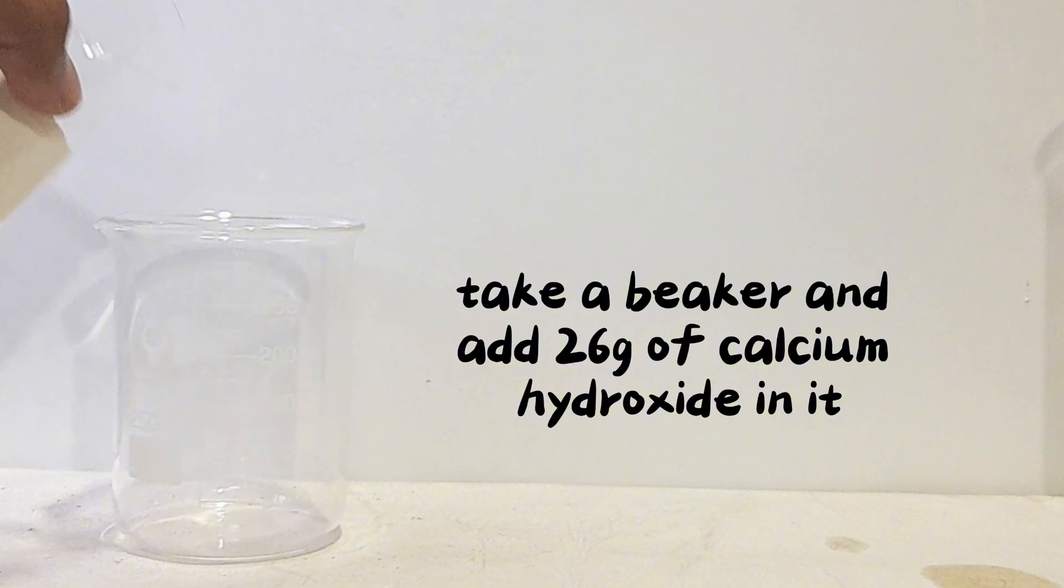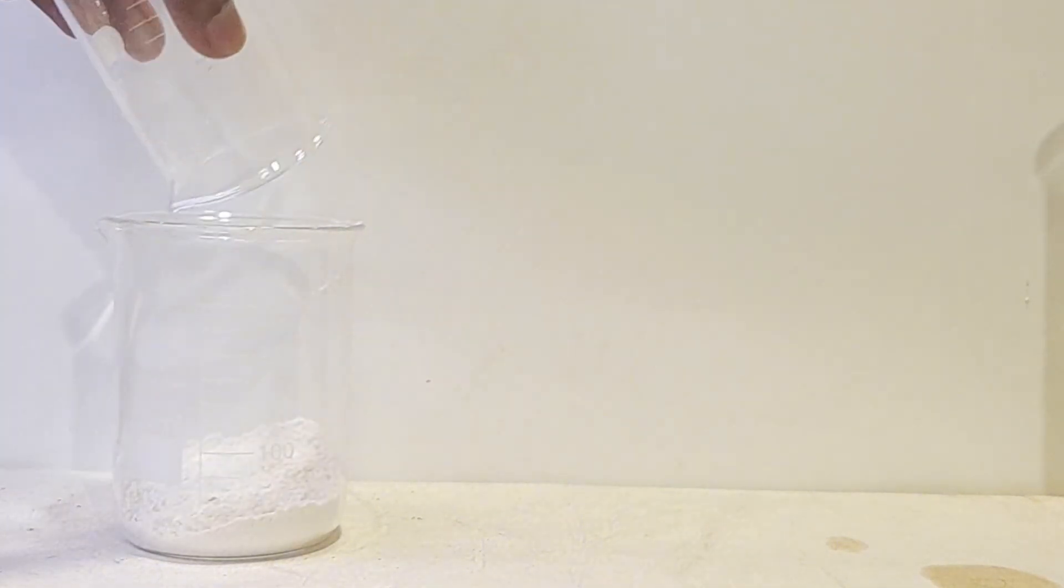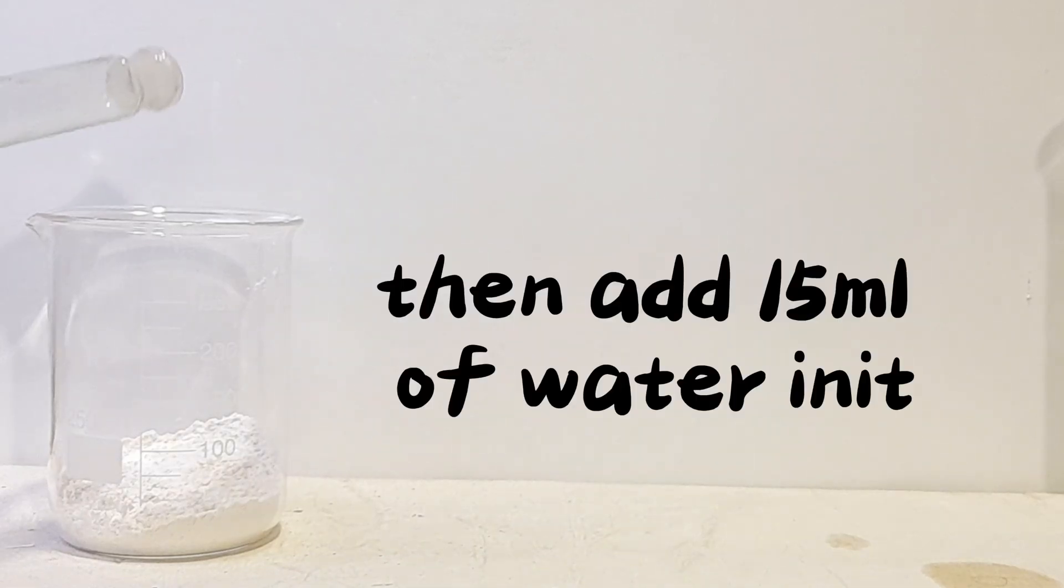Take a beaker and add 26 grams of calcium hydroxide in it. Then add 15 milliliters of water in it.